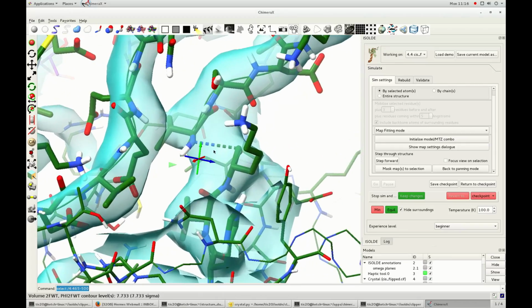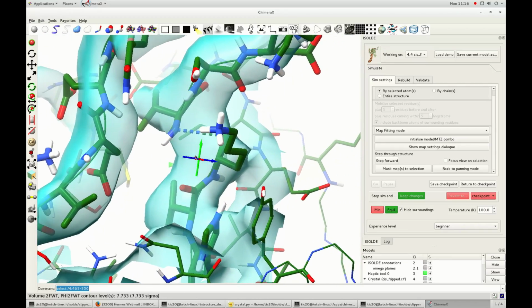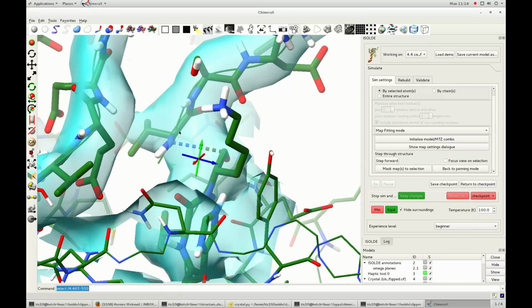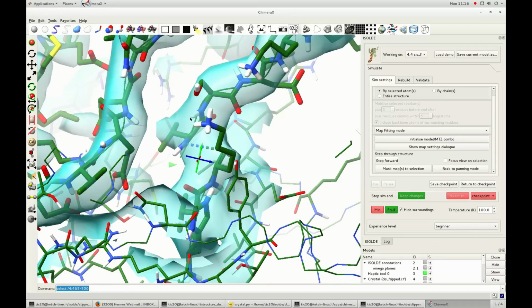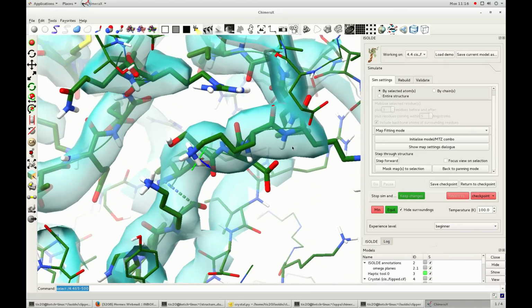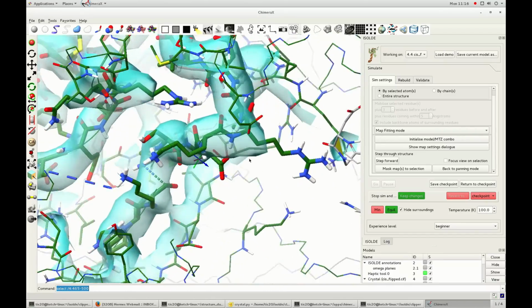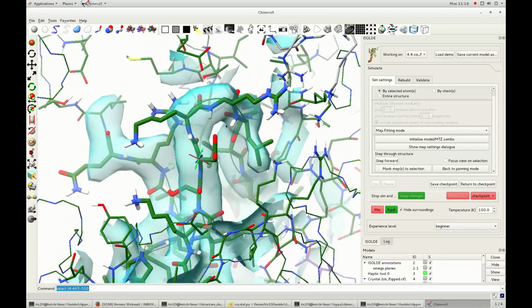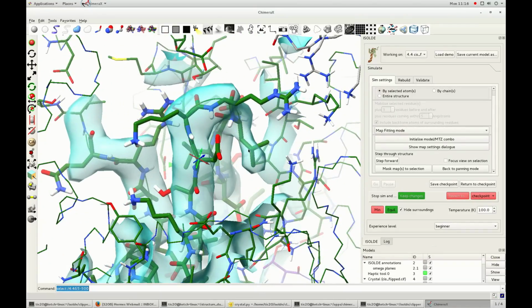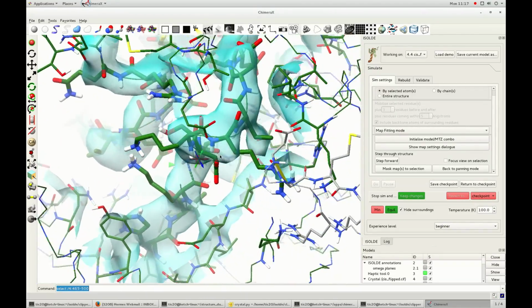I'm doing just that after clearing away all the cis-peptide bonds, and have come across this interesting problem. In the middle of chain 4, we hit a one residue break in the chain, where the sequence jumps straight from lysine 467 to valine 469, with no room for the intervening lysine residue. I can only assume that this came about due to an error in sequence alignment when generating the initial homology model, but it has gone undetected and led to a register shift in the following stretch.